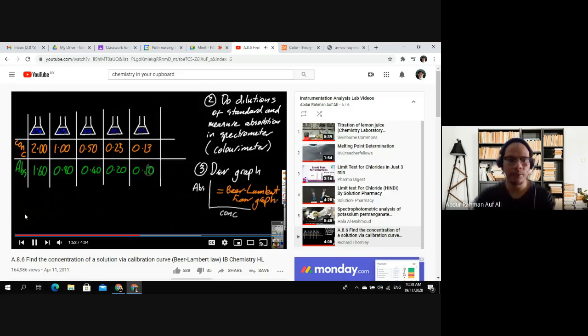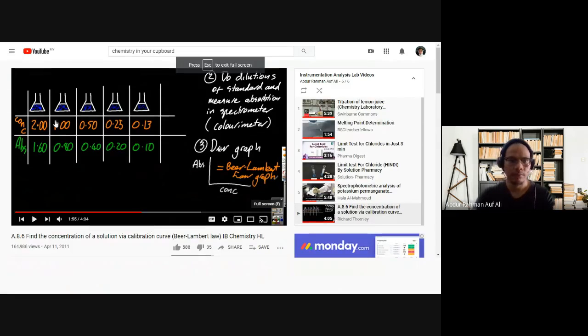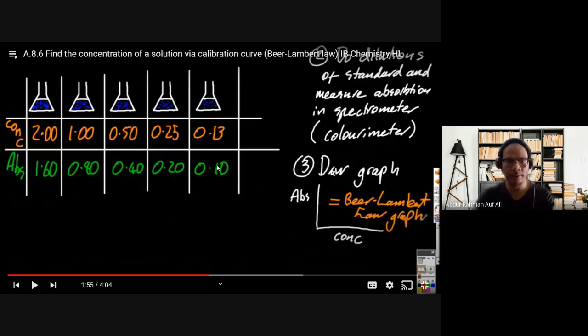Okay, so this video also explains the same thing. Bila dia measure different concentration of solution, dia dapati the absorbance of light semakin menurun. Okay, so this is known as the Beer-Lambert's law. So kalau kita plot this data ataupun data yang dalam video tadi tu, the graph should be a linear graph, a straight line going up.